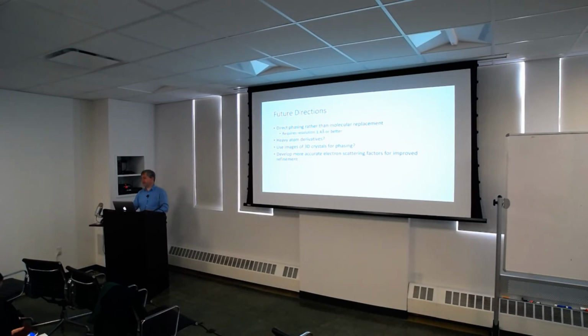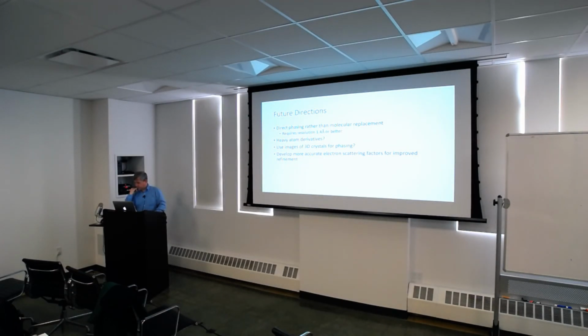The way it scatters is very different. I think anomalous diffraction is when you disturb the orbitals, basically, right? The electrons change orbitals, and that's how you get the signal. So what creates that? Is it an X-ray that bumps electrons to different orbitals, or is it electrons themselves?